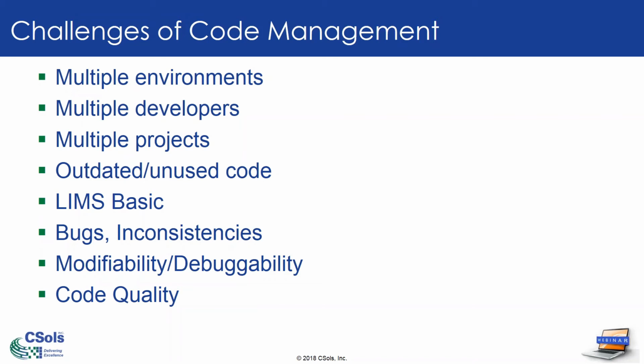So Adam is then going to discuss LIMS Basic, and again, he's going to get much more in depth with that. He's going to talk about bugs and inconsistencies, debuggability, how your code's modifiable, as well as code quality, which is really important for us at CSols.